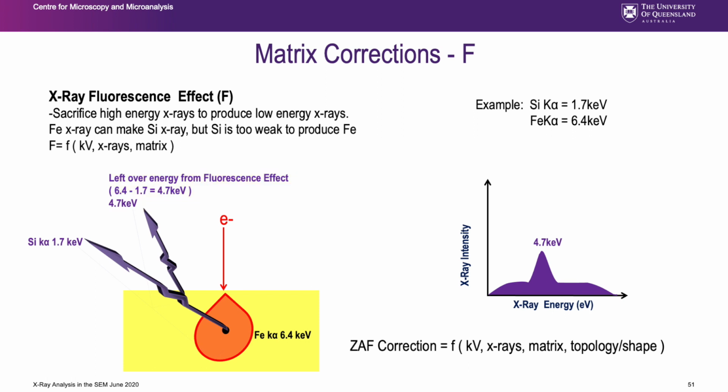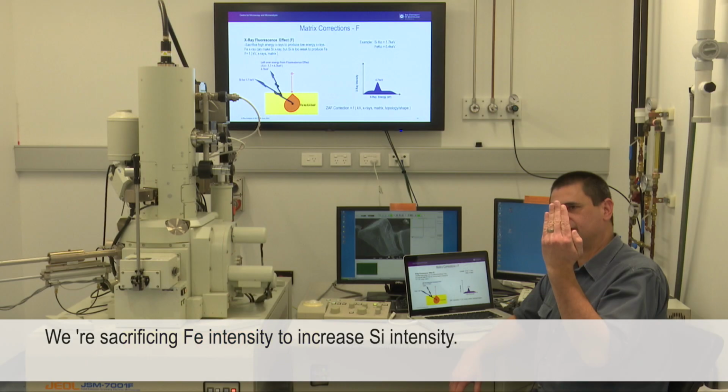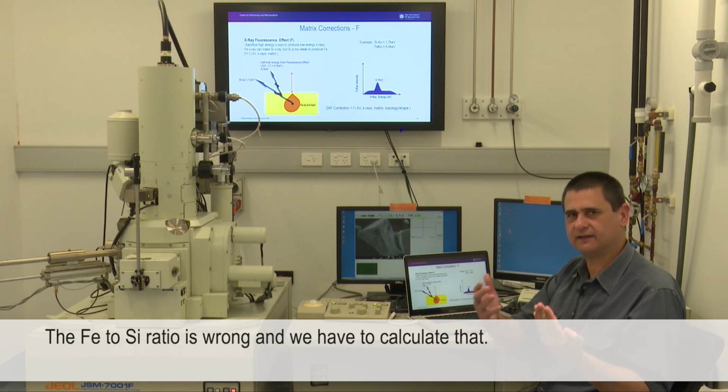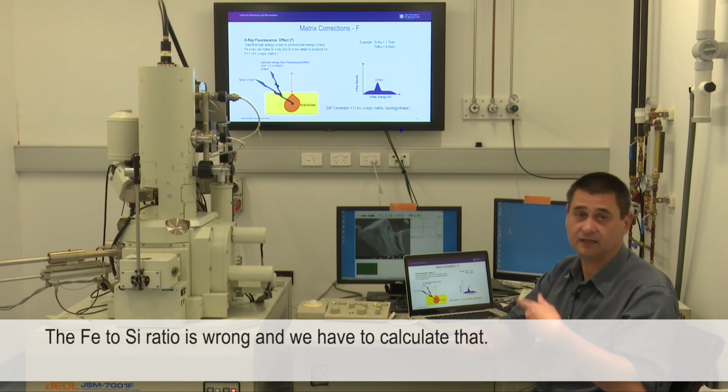We don't really care too much about the other X-ray, as long as we know it. If it's false and we ignore it, we've got no problem. We're sacrificing iron intensity to increase silicon intensity. So the iron to silicon ratio is wrong. We've got to calculate that.